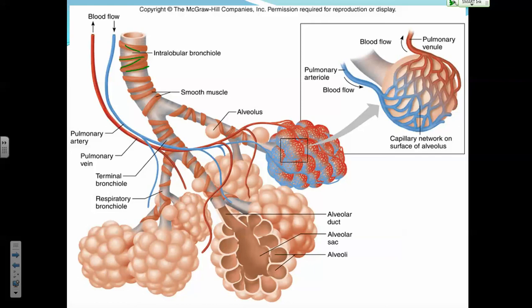Okay. So these will be some examples of bronchioles. There's different kinds, like I said, and you don't worry about the different kinds, but just the bronchioles are the microscopic tubes. But they ultimately lead to the little air sacs. Some of the air sacs are sitting right on a bronchiole, some are in clusters, but regardless, the air sac is called an alveolus.